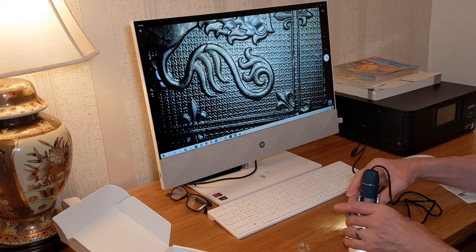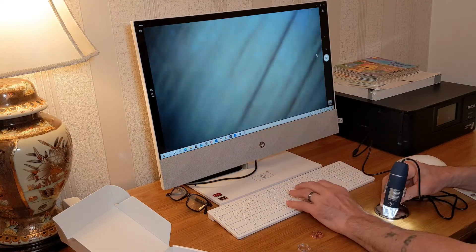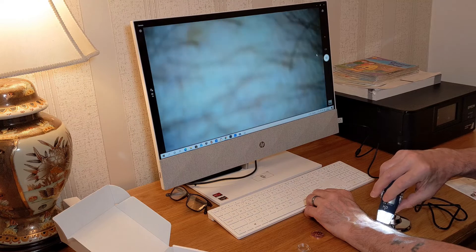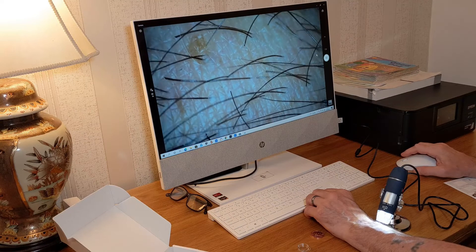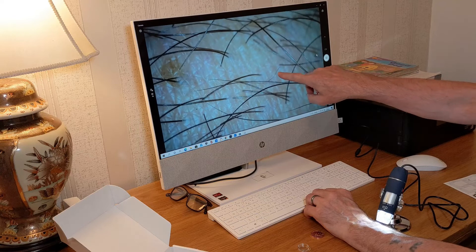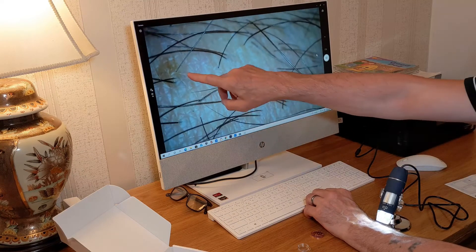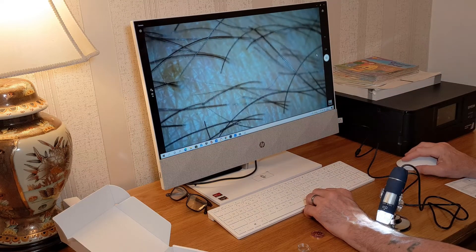This is the yucky bit - check out my arm. My arm looks okay there, doesn't it? It's not so bad. Have a look at this monstrosity though! What's that thing there? What's going on?! There's a weird-looking blue thing - I can't even see that with the naked eye. There's this patch there - I need moisturizing, I'm sure of it.